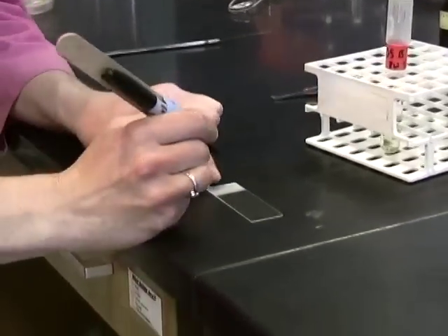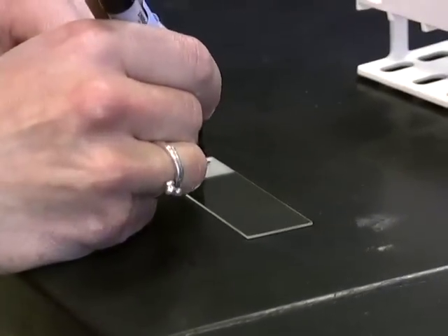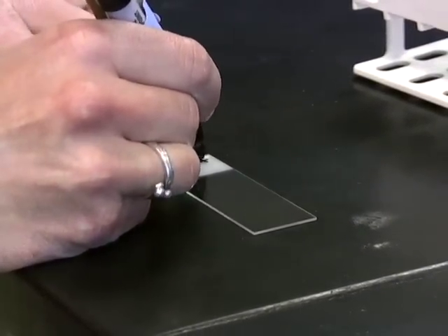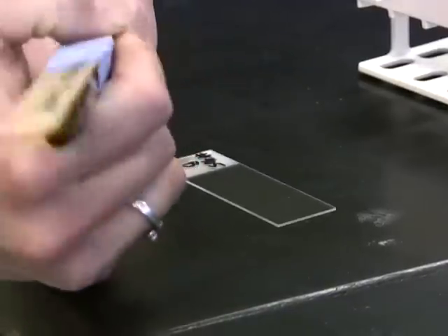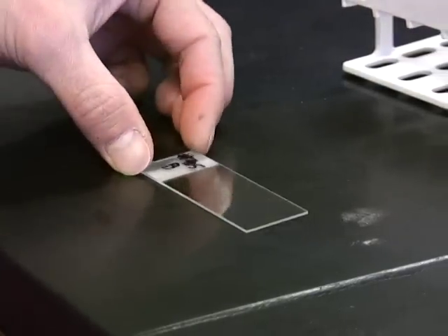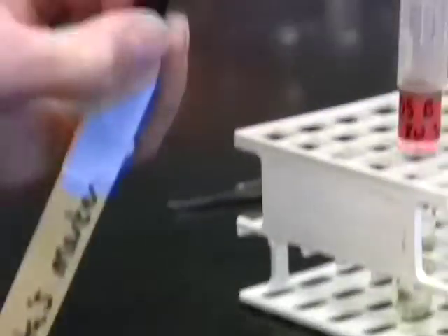Before you even do that, it's important to label the slide with whatever your unknown number is, and make certain to specify whether this is your unknown A, the gram positive, or unknown B, the assumed gram negative.